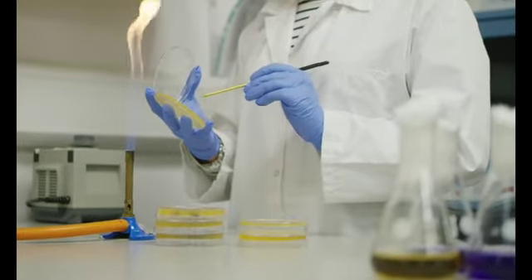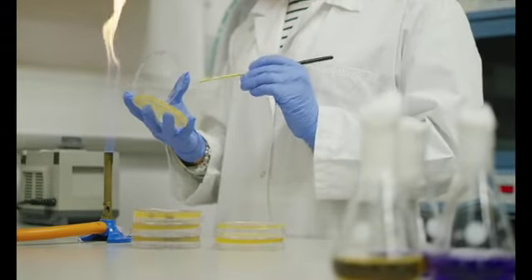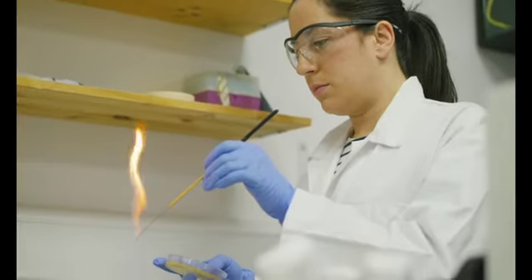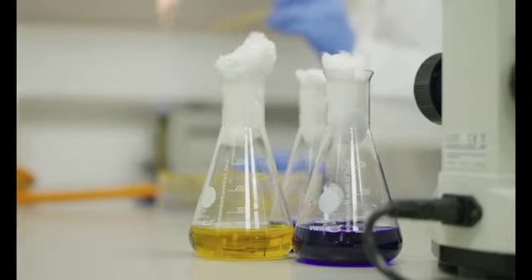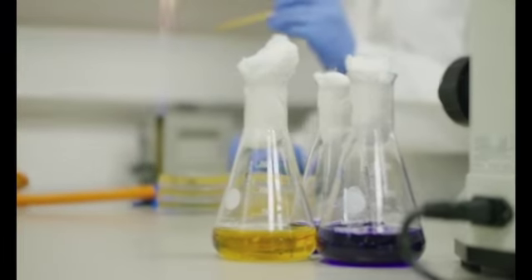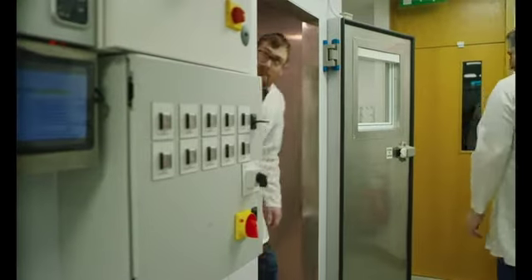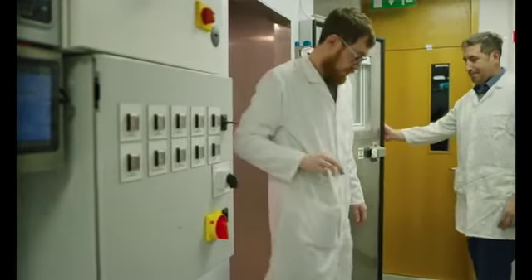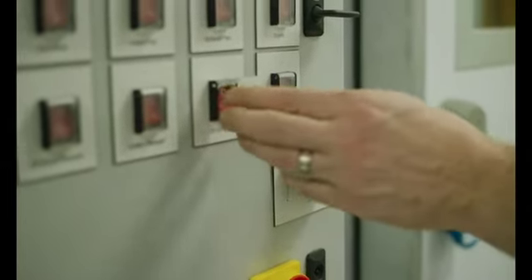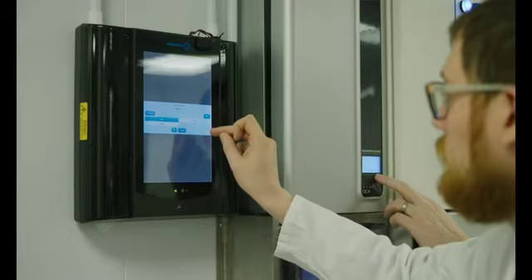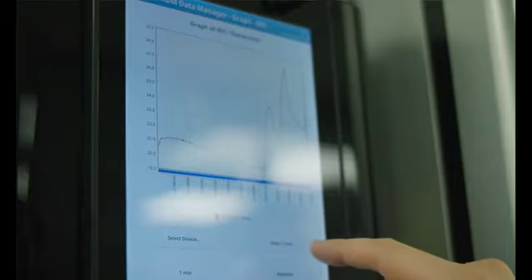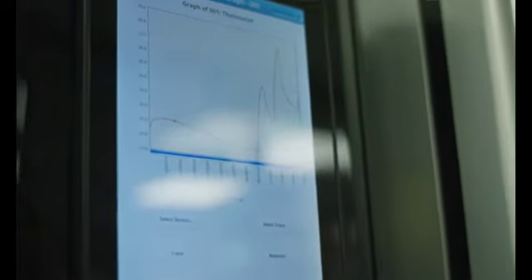We then have a microbiology lab where we can culture and grow bacteria which are used to help demonstrate the efficacy of the product during test, and thirdly we have a number of environmental chambers which are sealed chambers that allow us to test the efficacy of the product and show the impact of the patented Novaris devices on various pathogens.